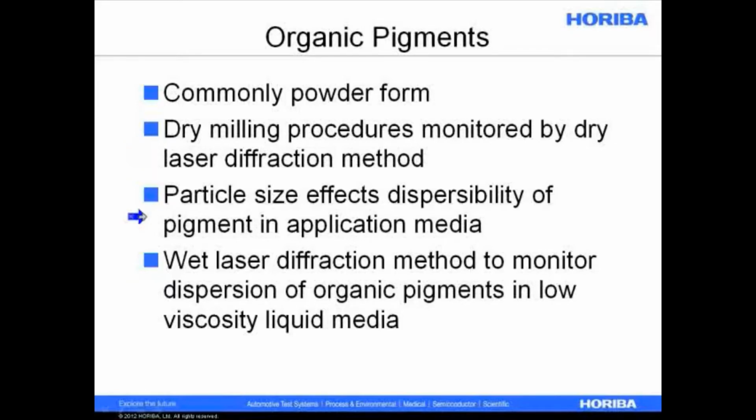If we're looking at powders that are dispersed in a liquid media, then we might be doing size, perhaps also zeta potential, although currently that might be a little more in research.